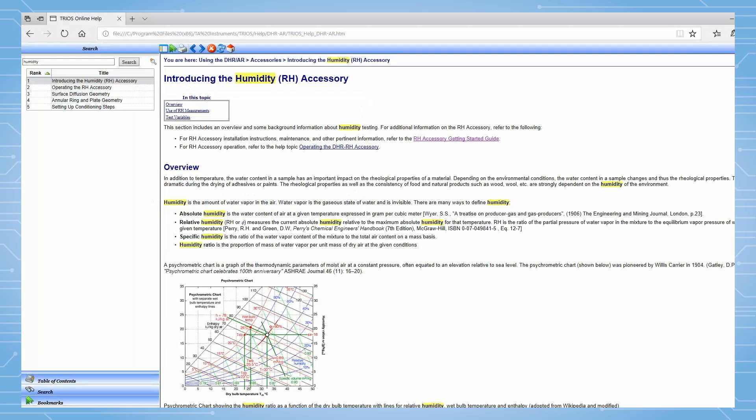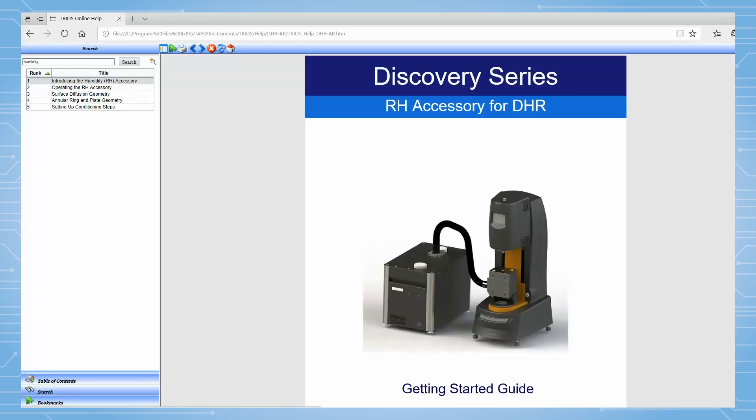If this is the first time setting up the humidity generator, please follow the RH accessory getting started guide from the online help manual to properly fill up the heat exchanger and saturator reservoirs and priming the temperature control system.